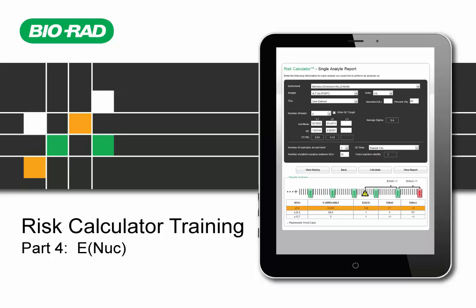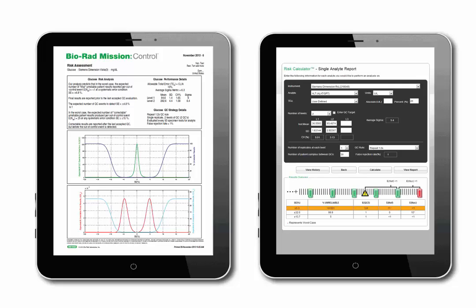Welcome to Part 4 of Bio-Rad's Risk Calculator training. The Risk Calculator generates a risk assessment report. This series of videos explains the different elements of that report.